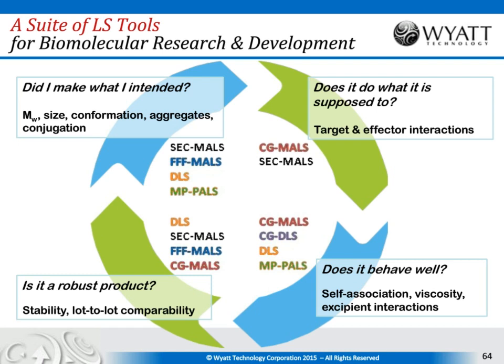Great, thank you. Could you discuss how precise the high-throughput DLS method is? Well, it depends really on what you want to measure. Let's say you want to measure the impact of formulation and you have some small aggregates forming.